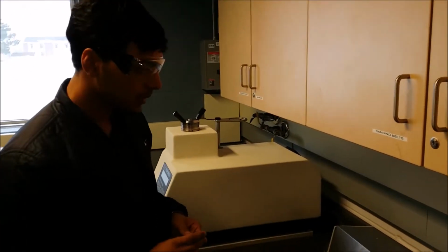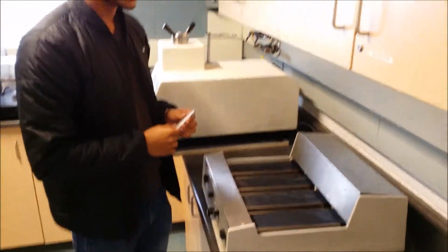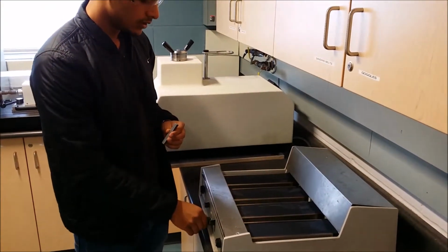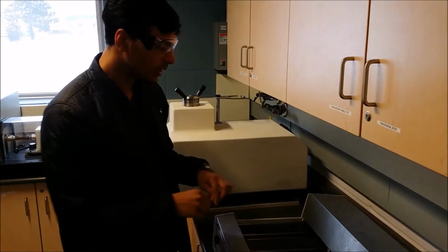So I'm explaining to you about this machine. You can see it's sandpaper. Starting from coarse to finer, we will wipe away all the impurities that come from the surface.